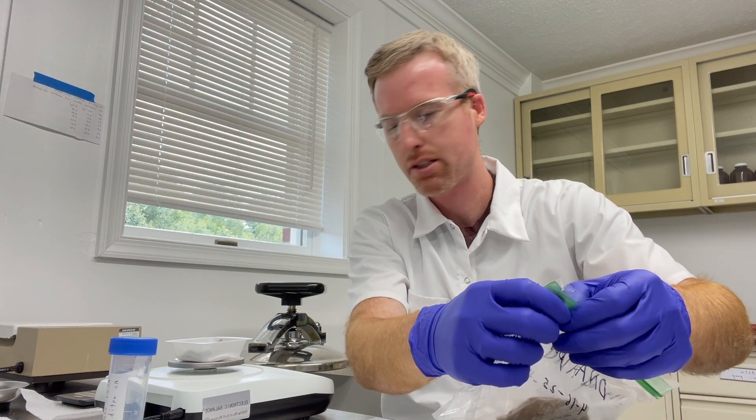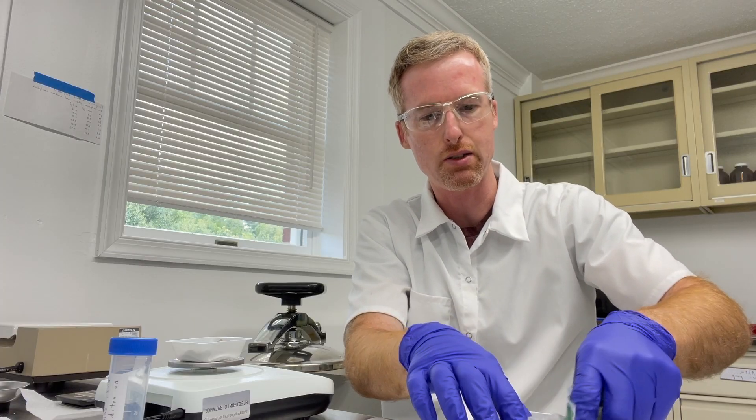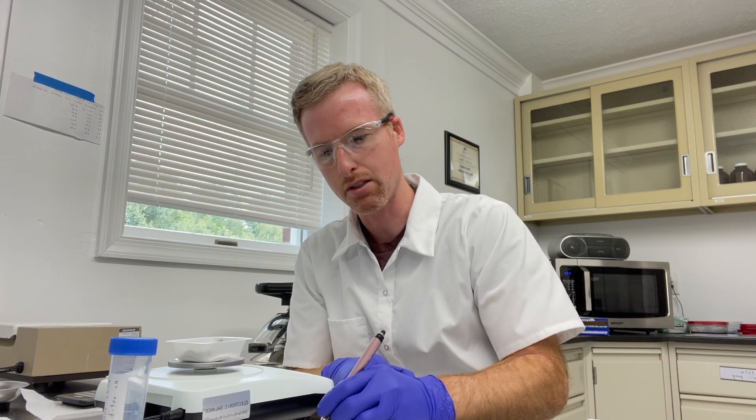So I have here 7.8 grams of E. coli cells, and I'm going to make a note of that because we'll need to know that later.